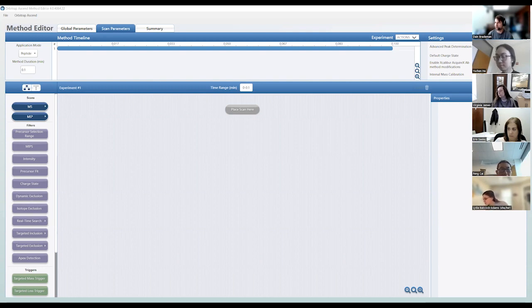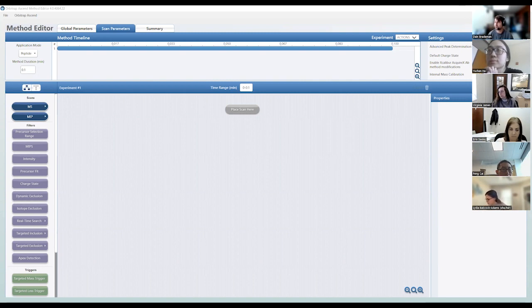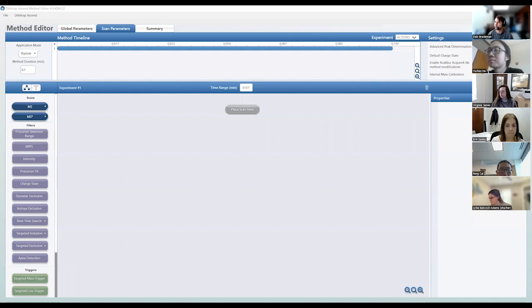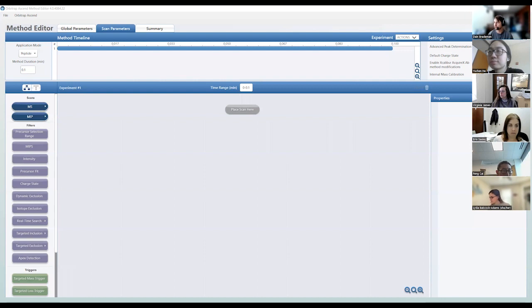What I'm showing right now is the method editor that you might see on either the Orbitrap Eclipse, IQX, or the Orbitrap Ascend. The instrument control software between them is pretty standardized — this is Tune 4.0, the Thermo standard release. Though my method editor reads Orbitrap Ascend, it should be identical for the Eclipse or the IQX, so if you have those workstations installed, feel free to follow along and ask questions.